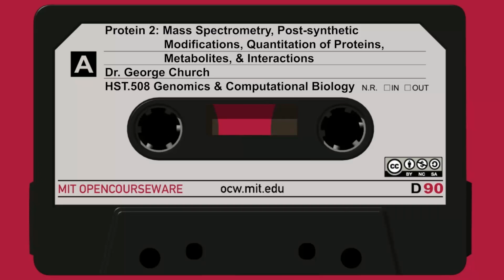So this analysis, critiqued a little bit in the subsequent paper that we'll talk about after the break, can be interpreted as being consistent when you include all the proteins. You have a very good correlation coefficient. This is a linear Pearson correlation coefficient. But as you restrict yourself to the lowest abundance proteins, it sort of falls apart. You have less significant Pearson correlation coefficients.